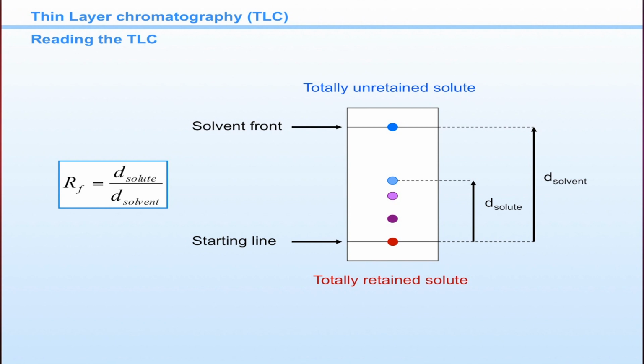It can be ethyl acetate or chloroform or hexane, whatever it may be. This solvent depends upon what type of sample you are going to separate. Based upon this, your organic solvents are selected. Now your stationary phase and mobile phase are both ready. You have to separate the components. As I said in the earlier chromatographic technique, you have to use your glass beaker, which is filled with the organic solvent, which you are going to use based upon the components to be separated. You are going to take the TLC plate which is spotted with the sample. After loading, you are going to keep it inside the glass jar. You are going to close it.